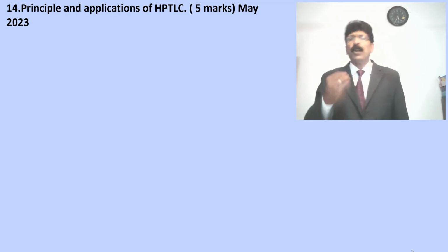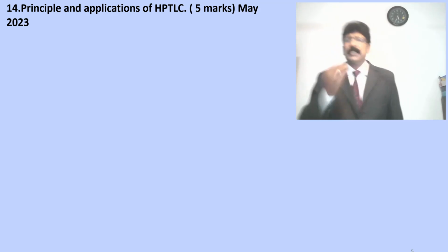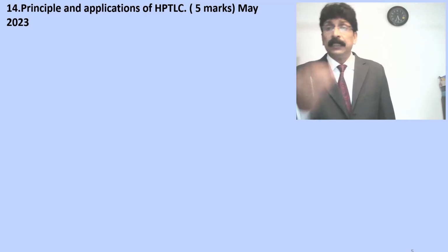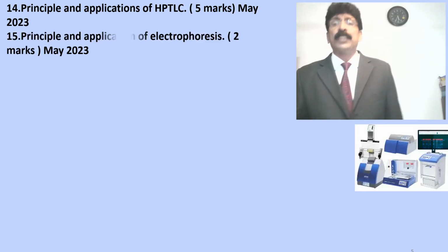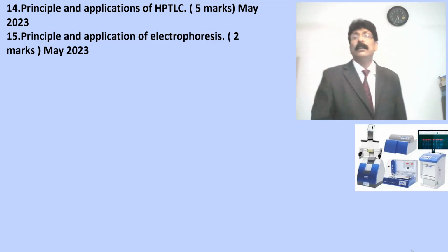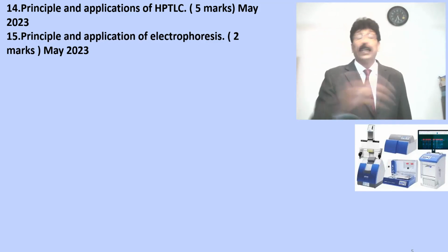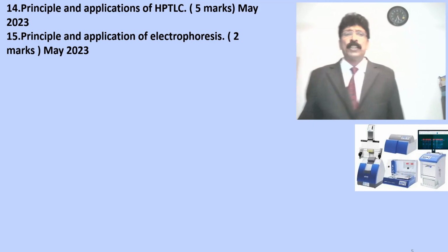HPTLC, high performance thin layer chromatography, is one of the important techniques for various separations on a thin layer, and also for more sophisticated, more interesting materials which can be determined. These are all the instruments which are needed for HPTLC. We will have a discussion about HPTLC.